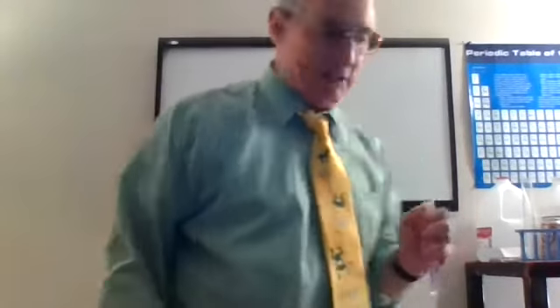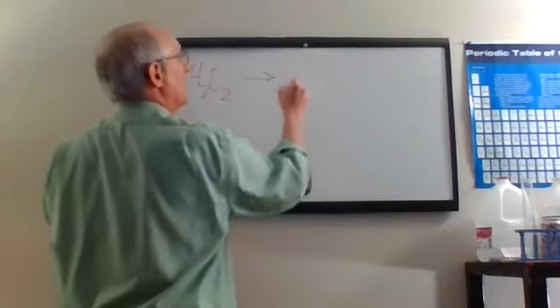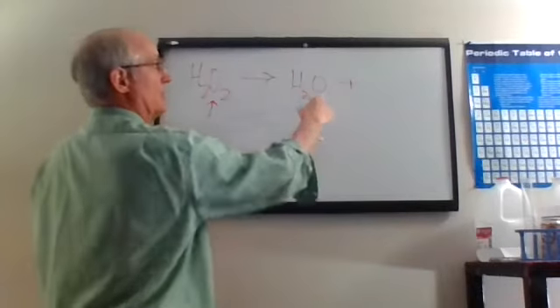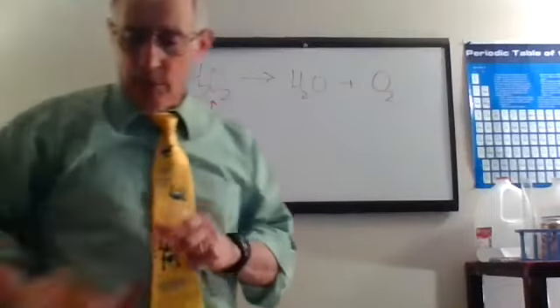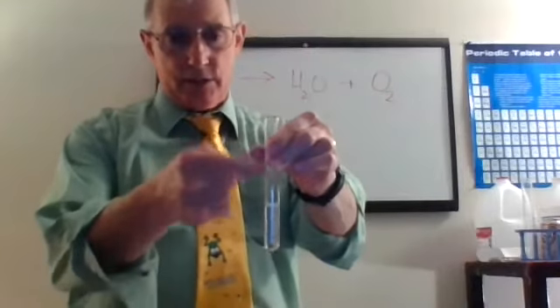It's breaking down into water, and what's released? Well, let's take a look here. H2O2 becomes water, and what is the other element that is left over? There's two oxygens, one oxygen. We're going to get some oxygen. Now, you've got to balance that thing out, so I won't do that right now because I just want to show you the demonstration. There's oxygen that is accumulating up here in this test tube.